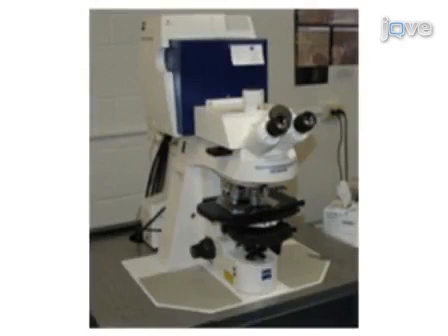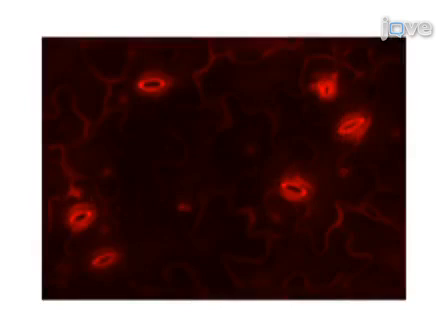The stained leaves are cut and the leaf pieces are incubated on top of a bacterial suspension. Finally, the leaf surface is observed under the microscope and stomatal apertures can be measured. The results obtained using fluorescence microscopy show changes in the stomatal aperture in response to bacteria.